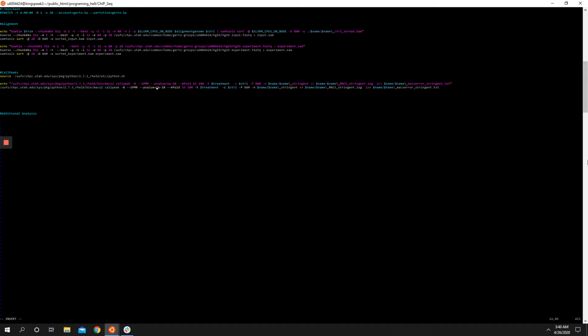Normally it uses your standard 0.05 for a false discovery rate, but here we're running a little more stringently, asking it to give us peaks that it's very confident in. That's just something we do in this lab. We also typically run it with a standard p-value, because some things don't call as well based on how your sequencing went or what the ChIP profile of the actual calls looks like. So we do it both ways just in case.